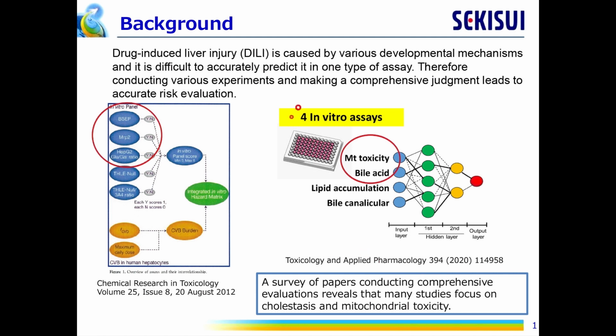The white figure is from Chiba University in 2020. In this article, they conduct 4 in vitro assays: mitochondrial toxicity, cholestasis, lipid accumulation, and bile canalicula extension, which is not usually conducted, but in this case was appropriate.